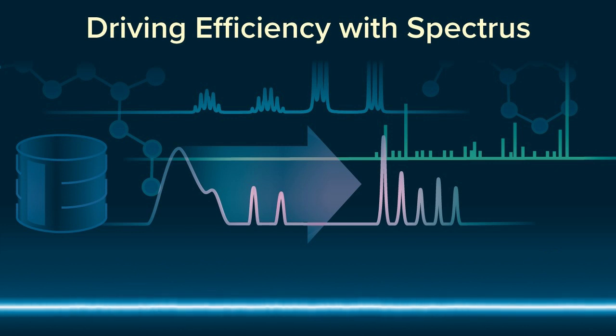And then once we can start to treat our instruments with care, we can look after them properly, we know what they're doing, can we start to reduce the number of physical experiments that we actually need to do to get that end result and start to use the data that we're generating on a regular basis in more of an in silico way that allows us to model and simulate chromatographic separations.